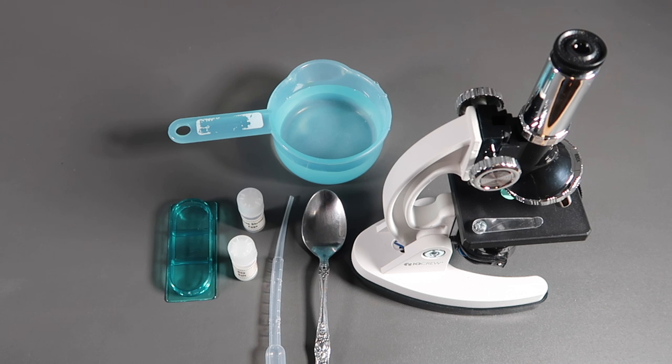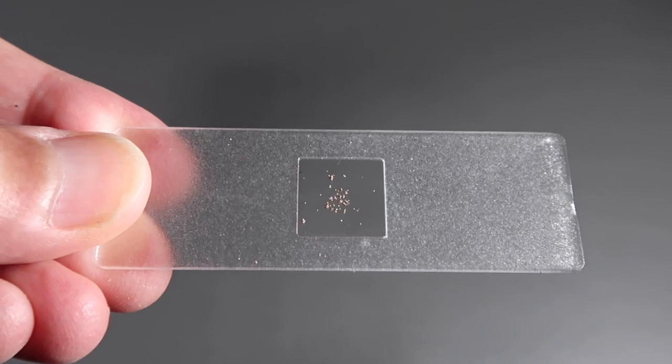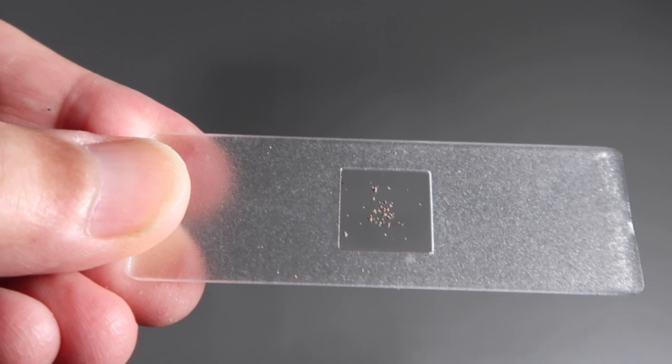Let's take a look at the brine shrimp experiment. For this we're going to need the microscope. Obviously. A cup of water, a teaspoon, a pipette. Which notice does not come with this kit. The shrimp hatchery, which is this little blue case here. A pot of brine shrimp eggs. And a pot of sea salt. And this is what the dry eggs look like.